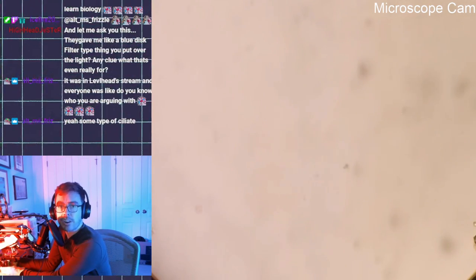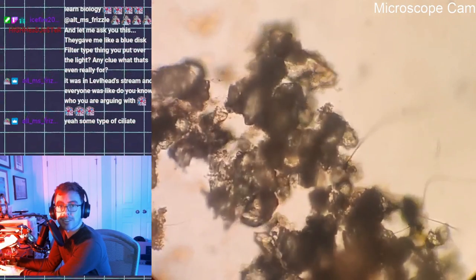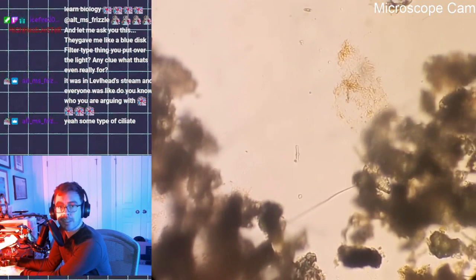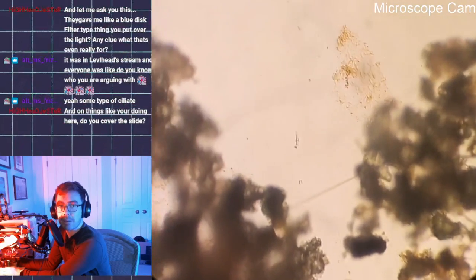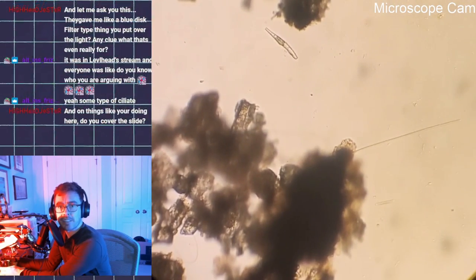Yeah, so regardless of whatever it was, Alt Miss Frizzle, it was a type of ciliate, which is a eukaryote. Also, if you're seeing it clearly on my stream, unless I have some kind of T Magnifica somehow, if we can see it clearly on my microscope, it's probably a eukaryote.